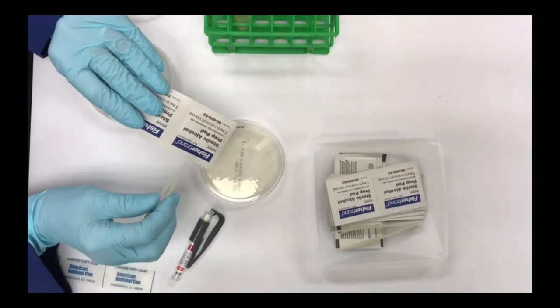Now you're going to place other ones, and you might use the forceps again on another plate. So after perfectly placing your 4 antibiotic discs on this agar plate, make sure you wipe the forceps down with sterile alcohol prep pads, as seen here. This way you won't contaminate your next agar plate.